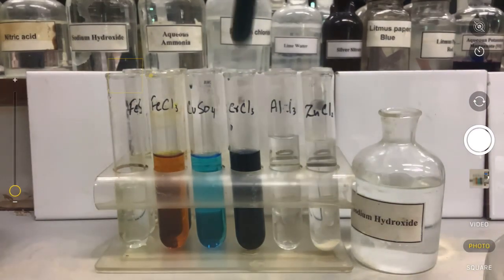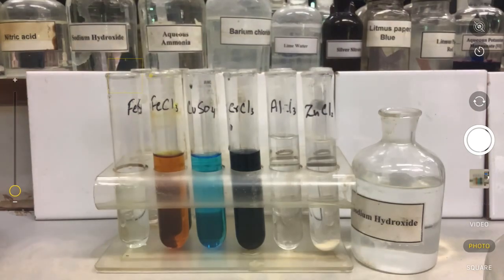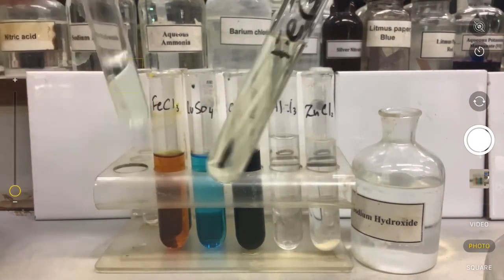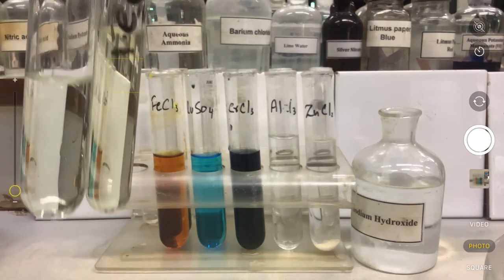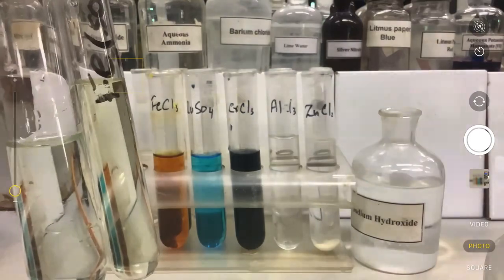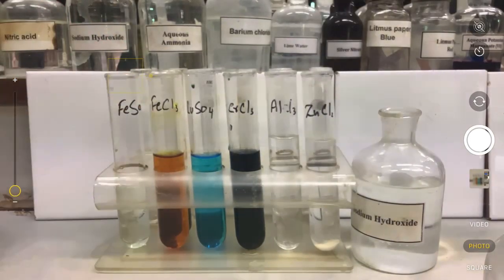Now let's move on and take another salt sample. This is a kind of yellow solution which already hints to us that iron 3 ions are here. Iron 2 is green in color and iron 3 is yellow in color, especially if it's iron 3 sulfate. You can see the color difference, which is not very prominent but enough for us to know.